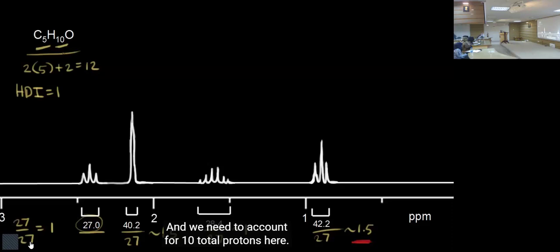They are in small quantity. And since proton NMR is the most sensitive NMR technique among all NMR, because 99.998% of protons are NMR active nuclei, that is why it's very sensitive. So it means all types of protons, even if it's an impurity, you will be able to observe it. Okay, but maybe it's just hidden behind your peaks.